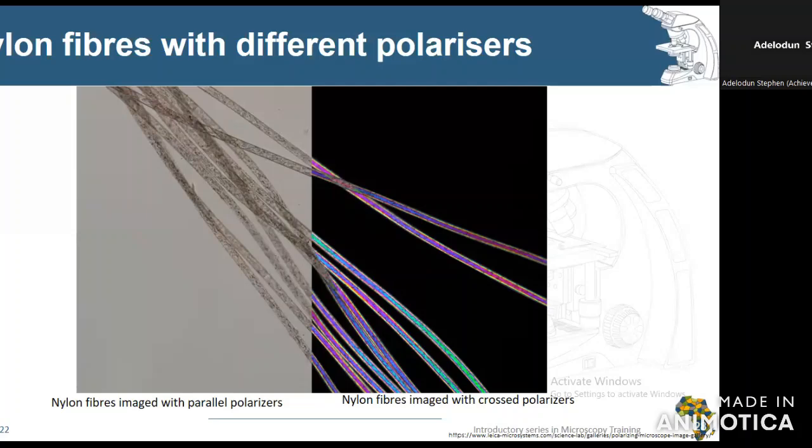refracted. So it's a kind of technique that can be used to study some materials like alloys, like metals, like ceramics and so on. So like I said, the optical properties of matter and also its anisotropy can be studied or investigated by using these kinds of techniques.